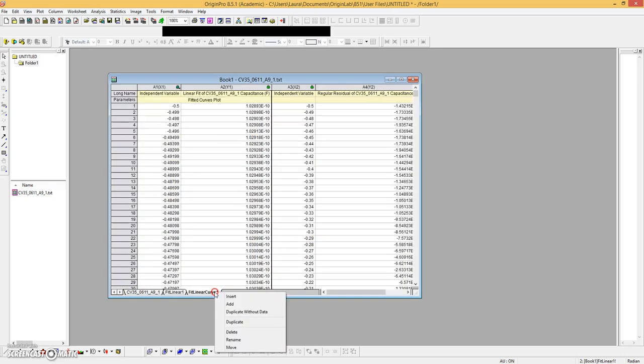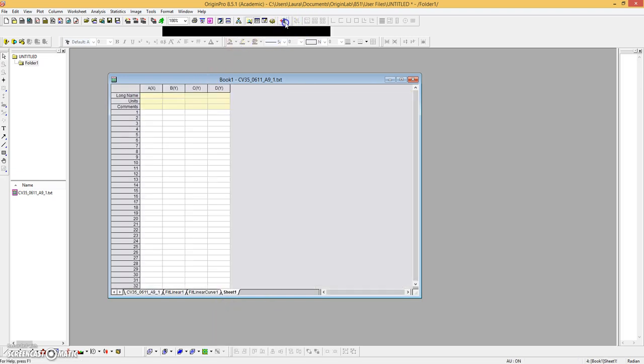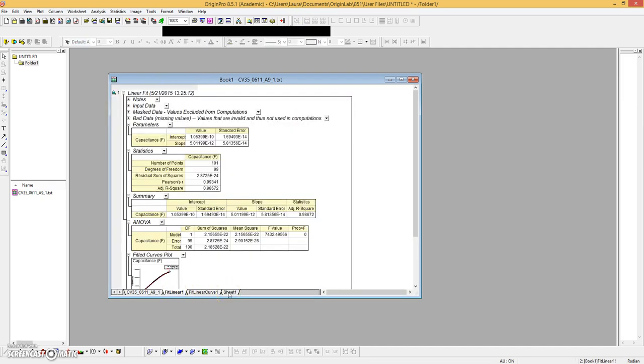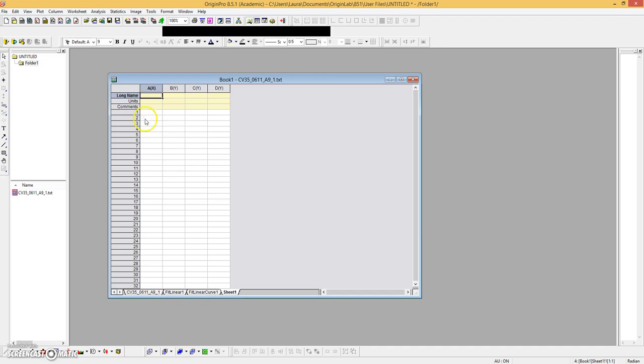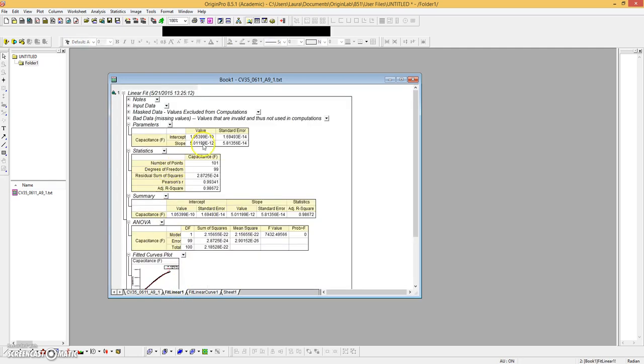So let's add a new worksheet with a couple of columns and we'll call them—let me just look back real quick—intercept, intercept error, slope, and slope error.